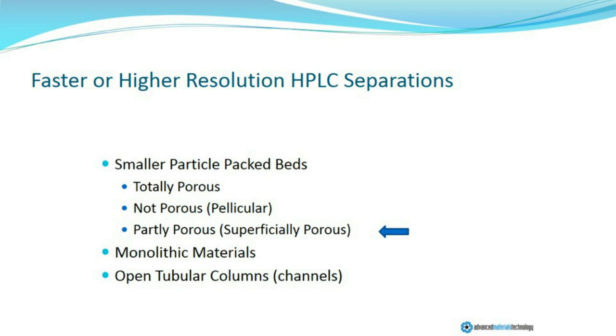Now, these are not the only options. There are other formats that have at various times been discussed and have a variety of useful roles in separations. These include monolithic materials, as well as a variety of different formats of open tubular columns or channels.